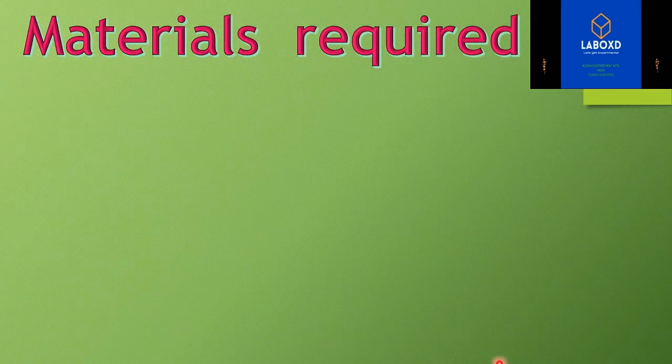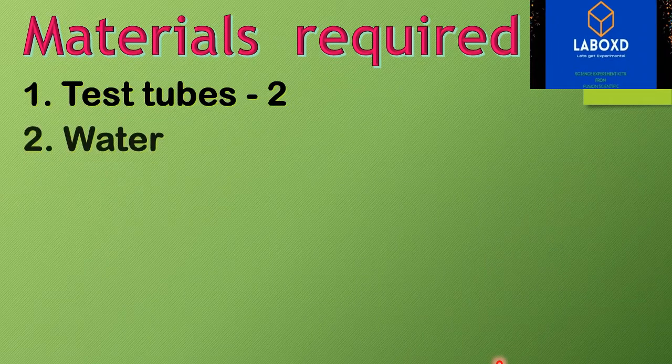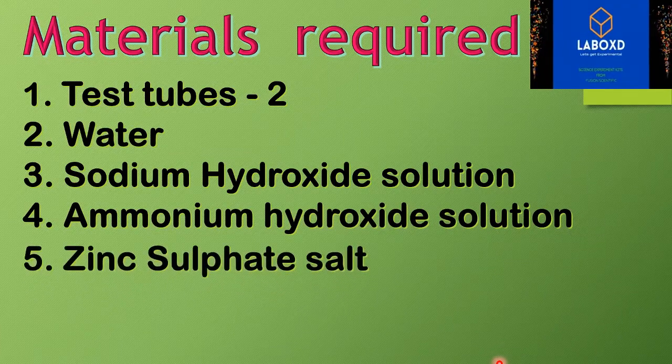The materials required are two test tubes, water, sodium hydroxide solution, ammonium hydroxide solution, zinc sulphate salt.